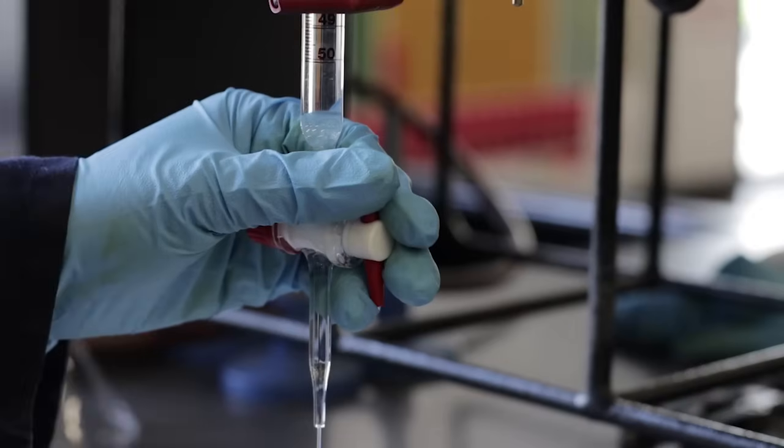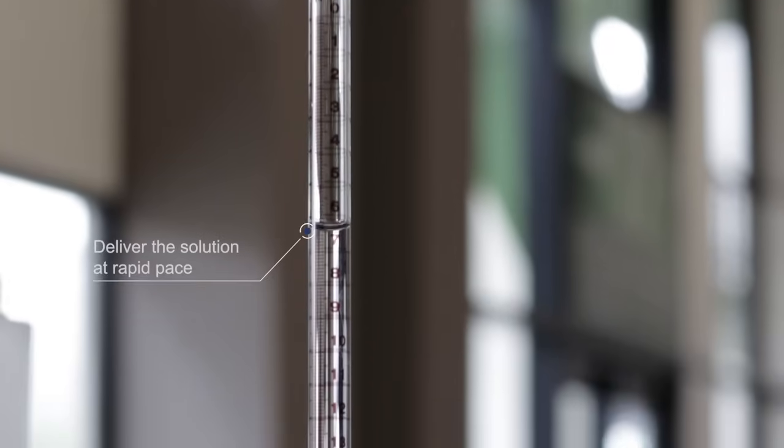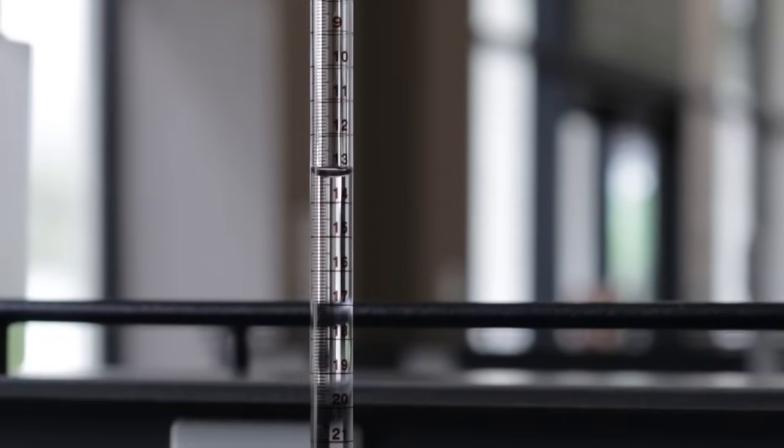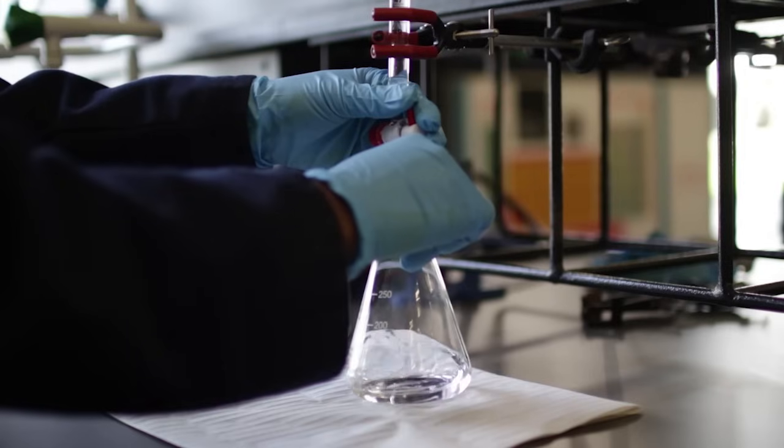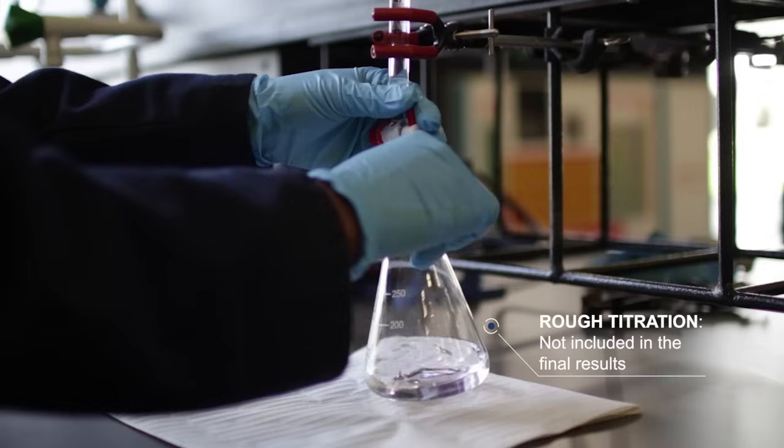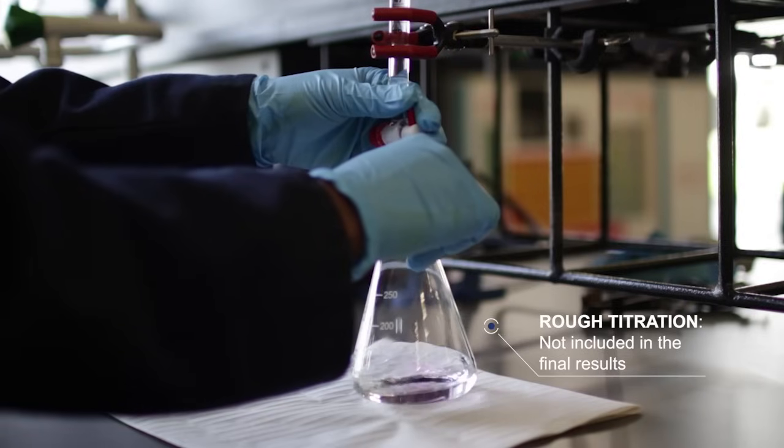When performing the first titration, the solution is delivered at a rapid pace to get a rough idea what volume is needed to reach the endpoint. This is known as a rough titration and it is not included in your final results as it is not accurate.